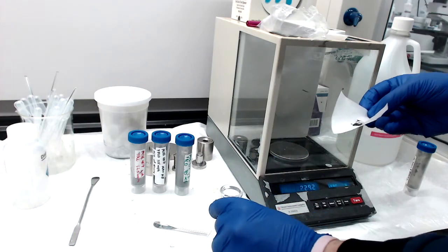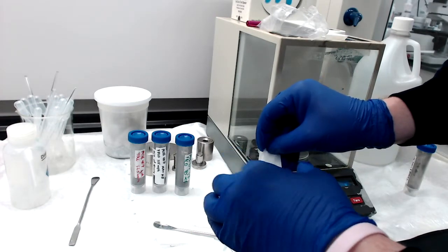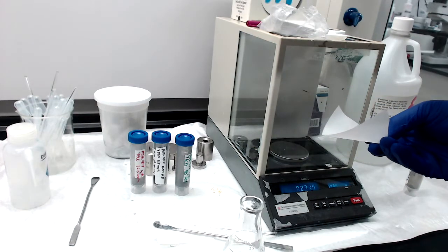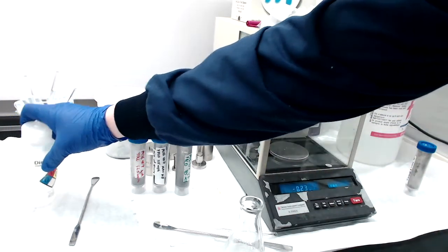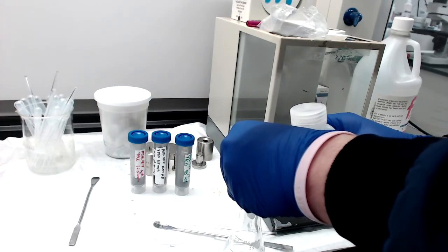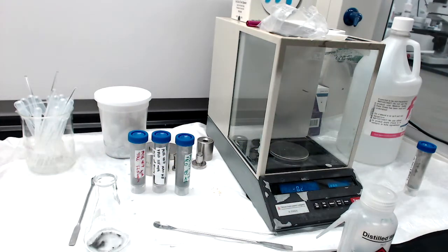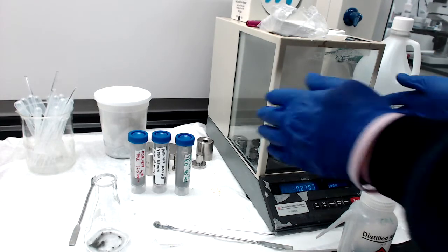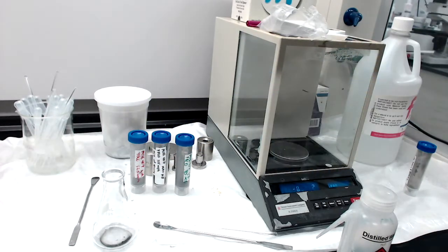I've got a clean 125 milliliter Erlenmeyer flask. We're going to pour the powder into it. We want exact amounts — so even if it doesn't look like there's anything on the weigh paper, I'm going to use water to make sure to clean off every little bit. If I say there's 55.2 milligrams of YBCO, I want to make sure that's the exact amount I have so I know what the copper valence and oxygen content of that amount is.